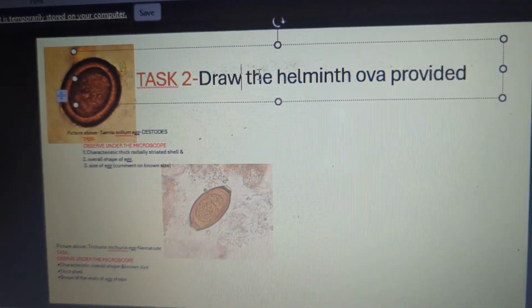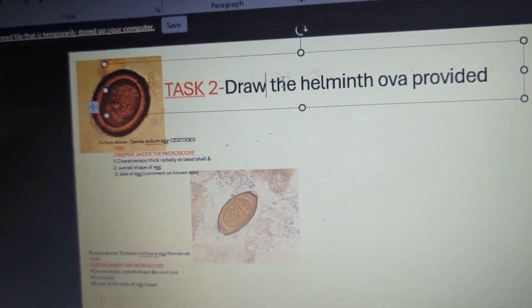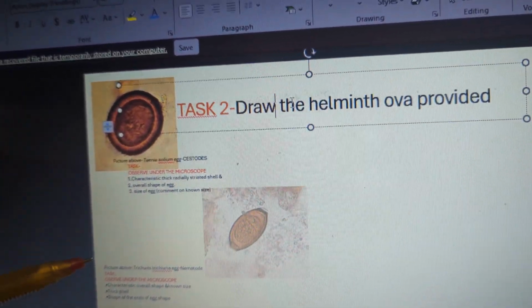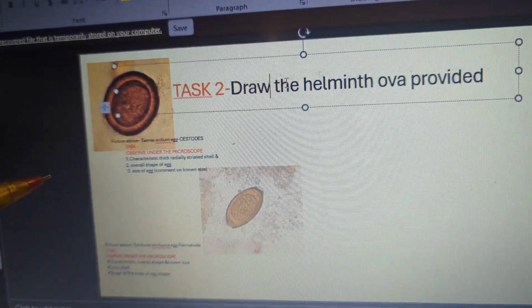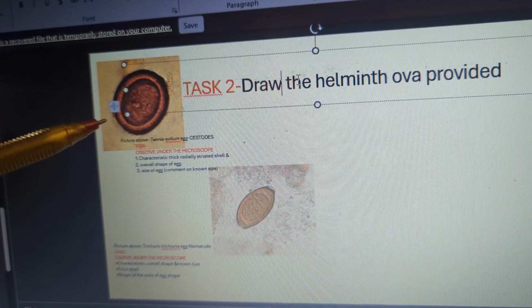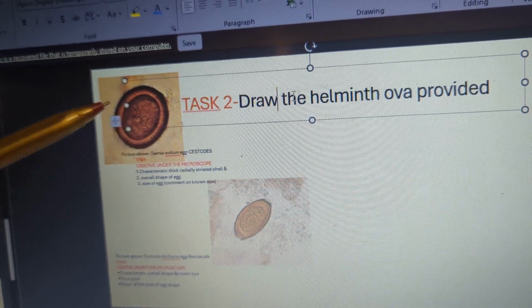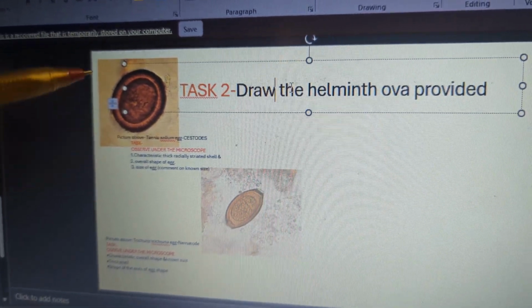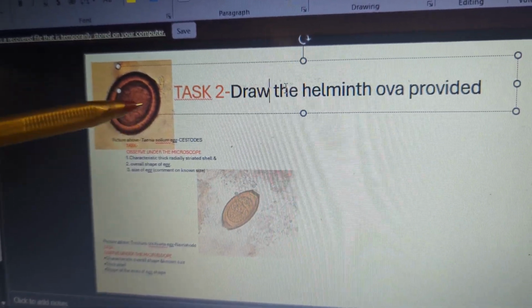Okay, so the previous clip ended on this slide, and I was saying that this view here of the task is a representation of what you will find on the bench also. It's called a bench aid. And so this taenia solium egg is exactly what you have in the microscopy station for your taenia solium, okay? But you can look onto the bench itself for the printout of the egg, and you can confirm as you look into the microscope that this is indeed a taenia solium egg using the aid, the bench aid.